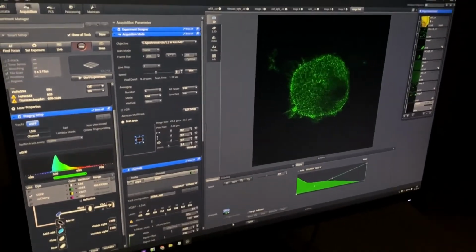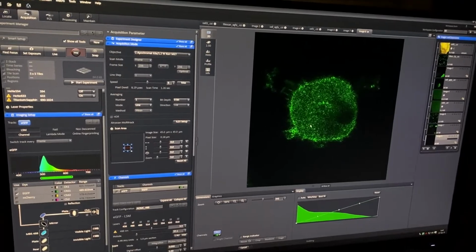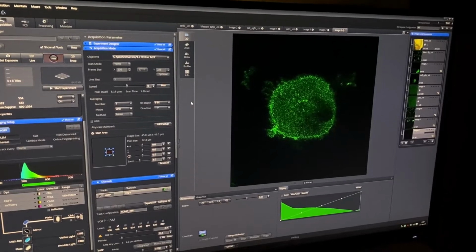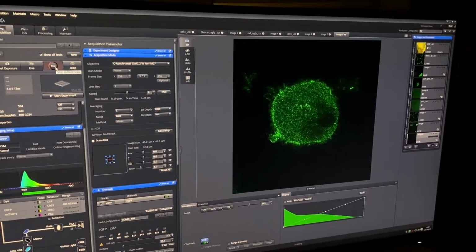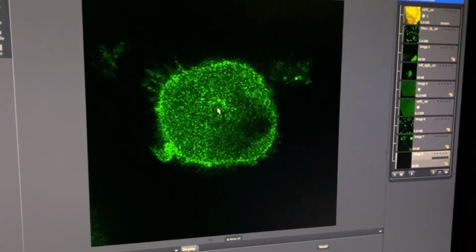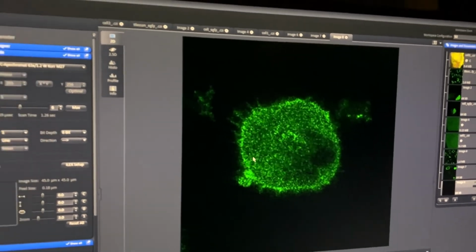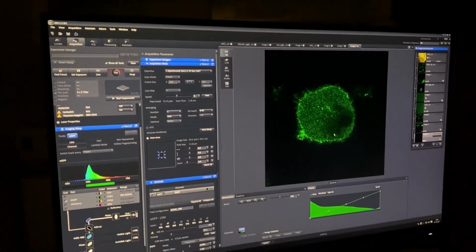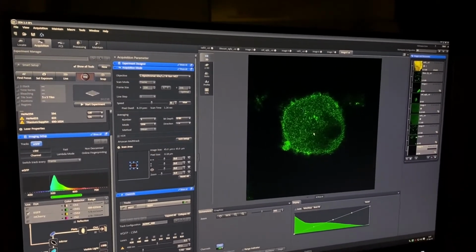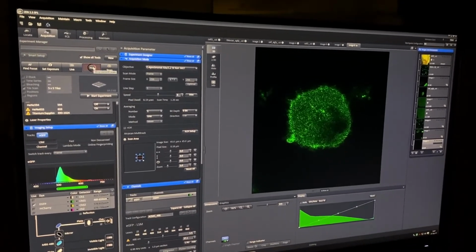So moving on to the next sample, we have a cell that's transfected with mouse Disc1. Normally Disc1 transfections are characterized by the presence of higher order oligomers that you can actually see as these blobs which are in motion. We think that these are higher order oligomers, which we will exclude from the analysis of Disc1 diffusion, because they will definitely hinder the analysis.